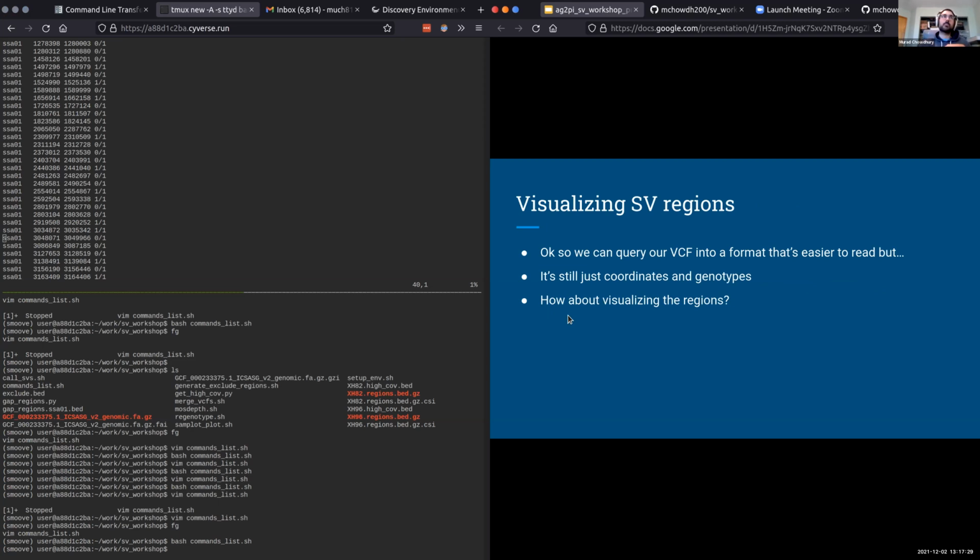We can also print various statistics and metrics for the validation of these types of variants, because one thing that's still common even after providing it with a set of good exclude regions is that most often you will see SV callers making a high number of false positive calls just by nature of the fact that in order to maximize the sensitivity of an SV caller, there's just going to be a fair number of false positives even after our initial filtering steps.